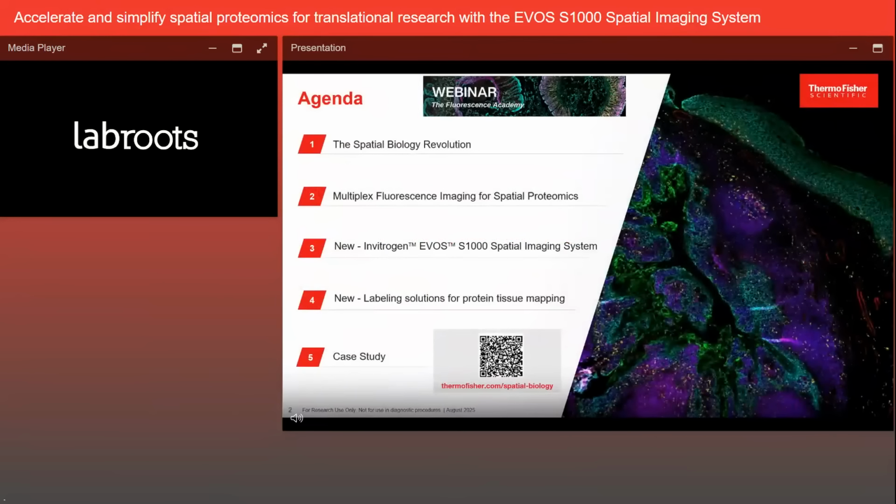So let's get started with the topic that we are going to be covering today. This is a webinar in the context of our Fluorescence Academy. So therefore, we are going to be talking a lot about fluorescent imaging, but we're going to be doing so in the very specific context of the spatial biology revolution. We are going to talk about what spatial biology is and why it has become such an important new field in life sciences. Then we are going to home in on spatial proteomics, specifically on trying to understand how to perform spatial protein mapping in tissue and why multiplex fluorescent imaging is such an important tool that we can deploy.